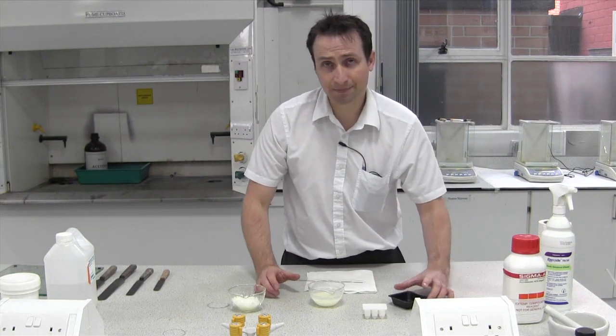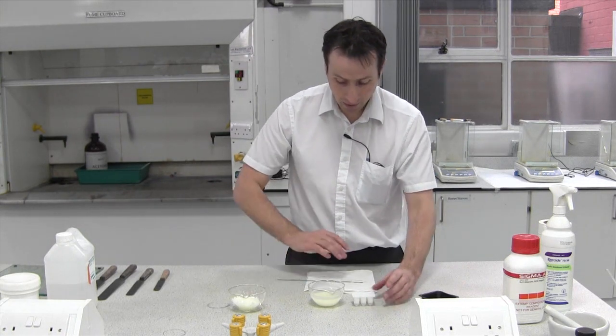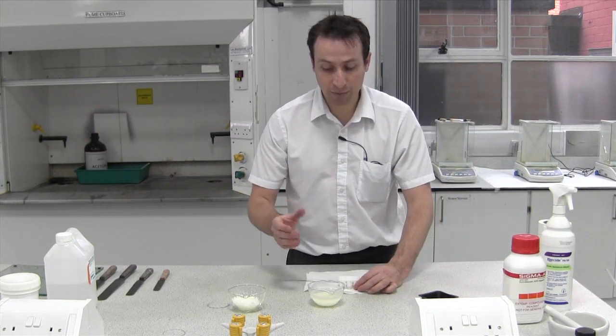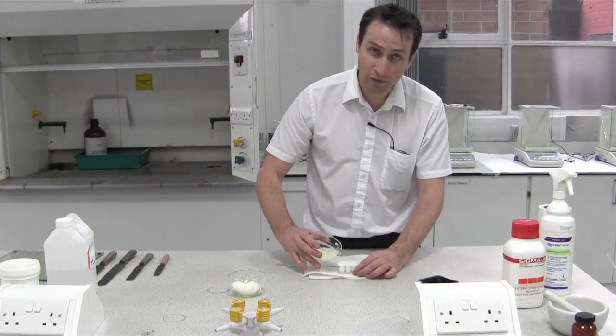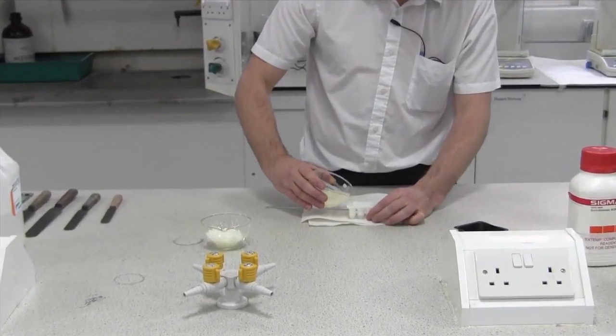The key to this is a steady hand and to make sure you don't spill it over the bench. I've got a bit of paper which I'm going to pour over to make sure I don't spill it on the bench and it's easier to clean up. Taking it very easily and gently, because you want to avoid trapped bubbles in the suppository — just pour gently in.